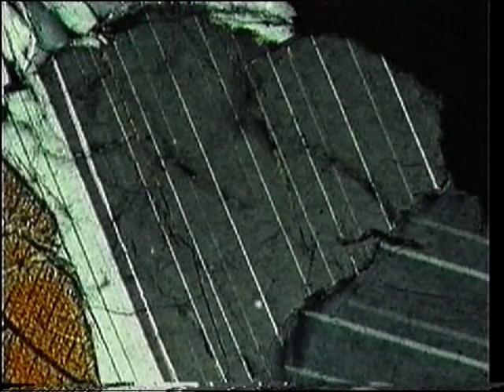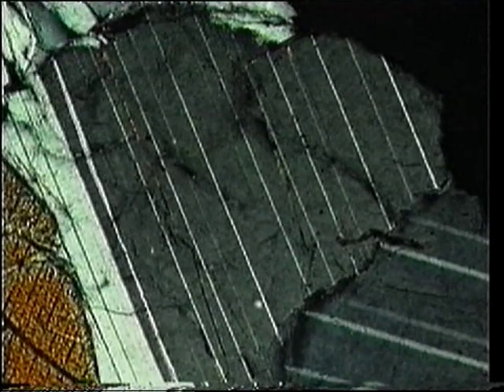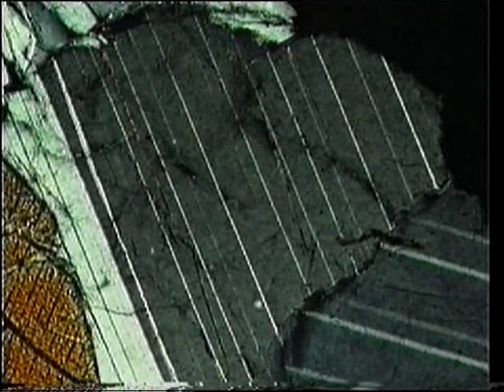I'll now demonstrate the search for grains cut normal to A. This grain is unsuitable as the 010 twin plane is diffuse and the 001 cleavage is not visible. Here, the 010 twin plane is sharp, but the 001 cleavage is absent.